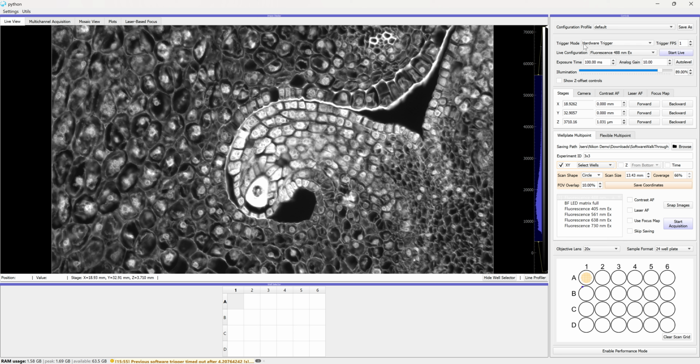Additional control we have here is our trigger mode. We have 3 modes here: software, hardware, and continuous acquisition. Software is sending software commands to both the illumination source and to the camera. Hardware trigger is sending the software command to the microcontroller unit, and then coordination happens there. Can be a little bit more precise, a little bit faster, really depends on your imaging needs. And continuous acquisition, for now, we may skip and put in its own module. So maybe I'll pick just software trigger for now.